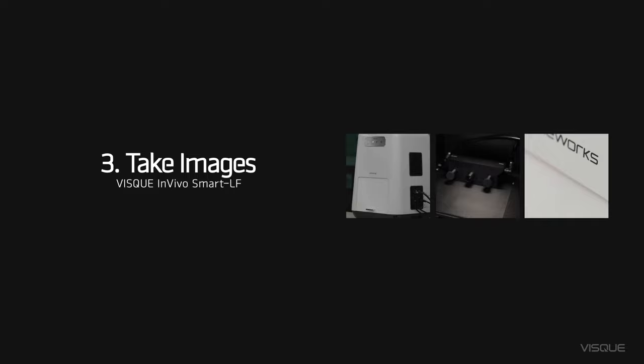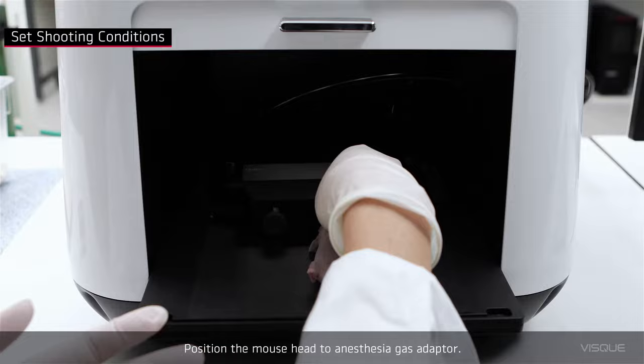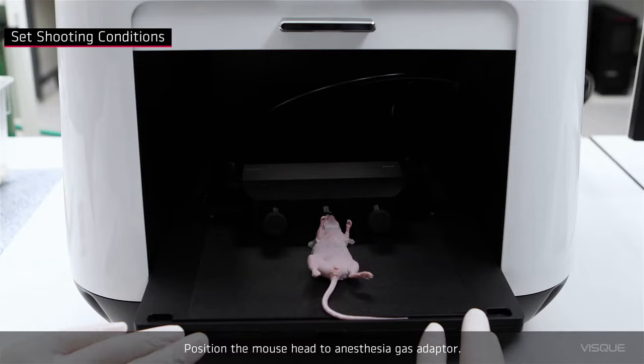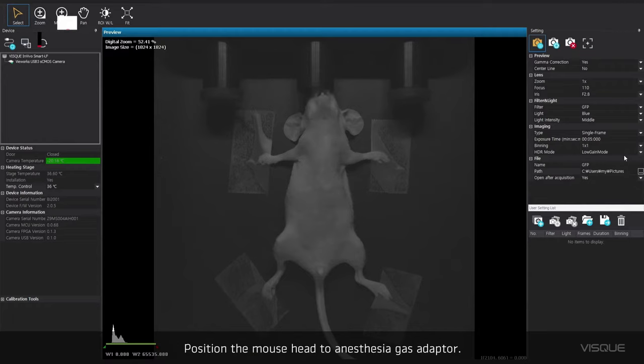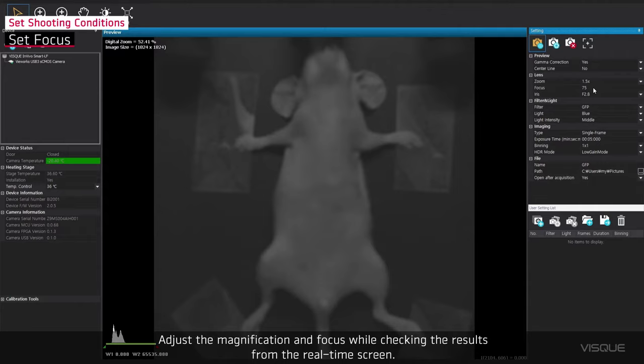Position the mouse head in an anesthesia gas adapter. Adjust the magnification and focus while checking the results from the real-time screen.